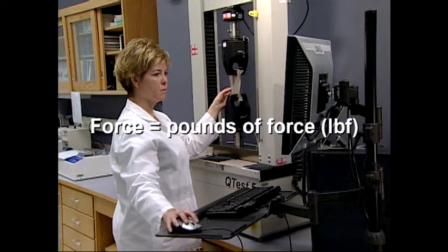standard specification. In the United States, force is expressed in pounds and referred to as pounds of force. If a fabric pulls apart at a force of 40 pounds, the tensile strength is referred to as 40 pounds force. The metric equivalent would be 178 newtons.